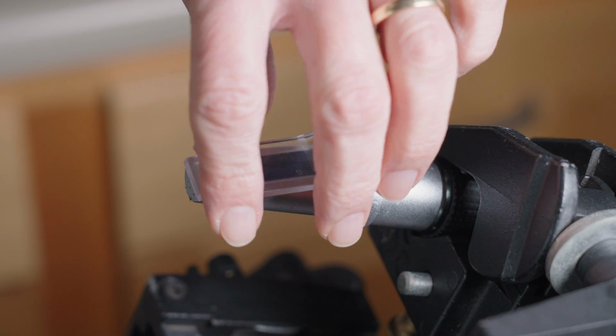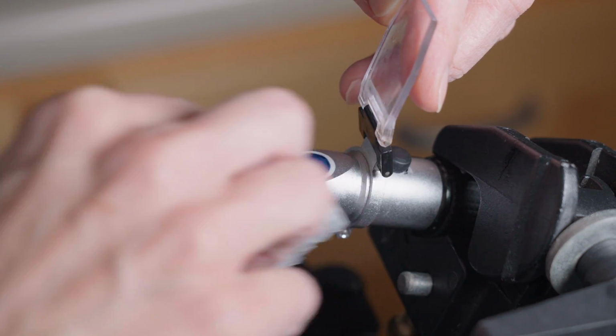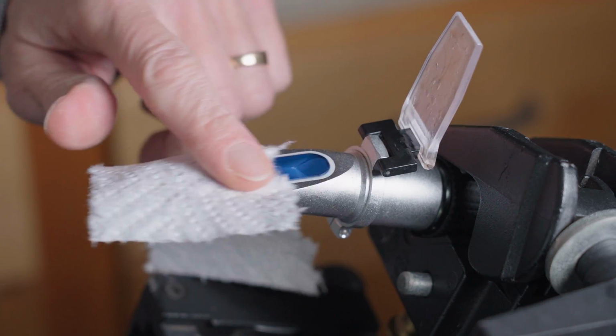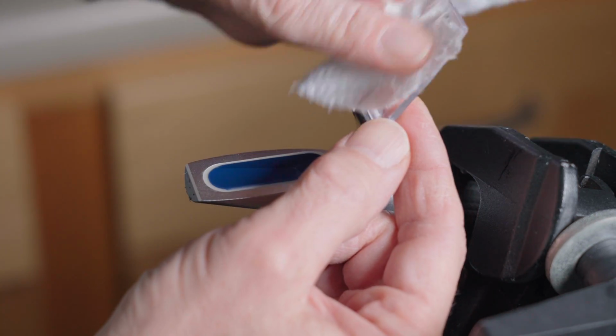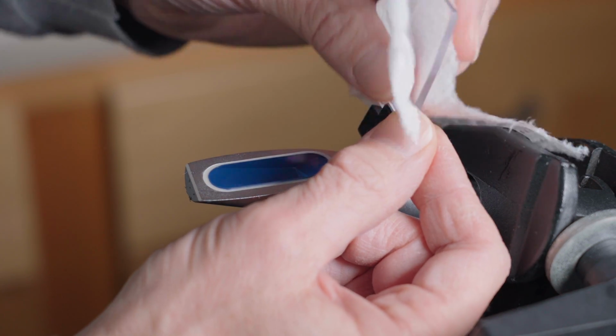Okay, first I'm going to start with just cleaning the refractometer. This is my normal brewing instrument, so I clean it on brew day, but it's probably good just to wipe it down ahead of time to know we're getting clear readings. And I will use the same method in between every single different test. Just so you know, if I don't show it, I'm still cleaning it and drying it with paper towels.